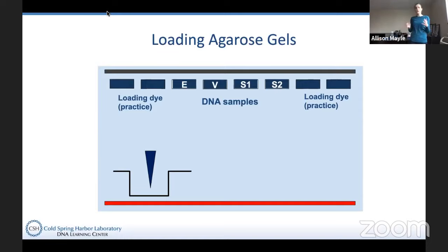So I had cut up the DNA with the same restriction enzyme for all of the samples. And then I also put in the DNA some dye, a special dye called SYBR Green that allows the DNA to glow when it's exposed to a blue LED light or a UV light. Otherwise, we still wouldn't be able to see the DNA. I'm going to talk about how we separate the fragments in just a minute.